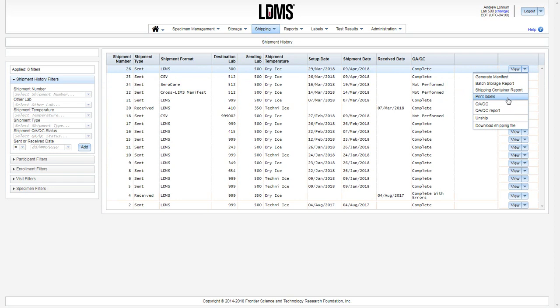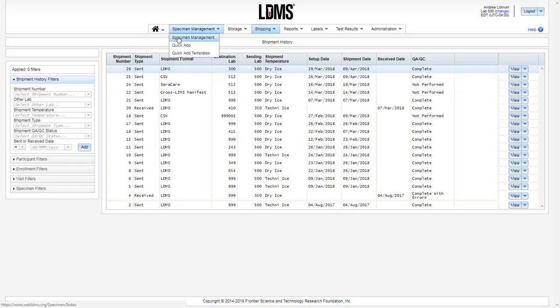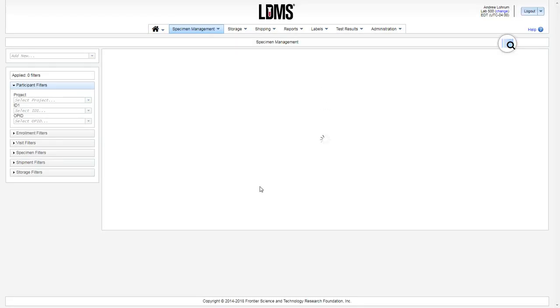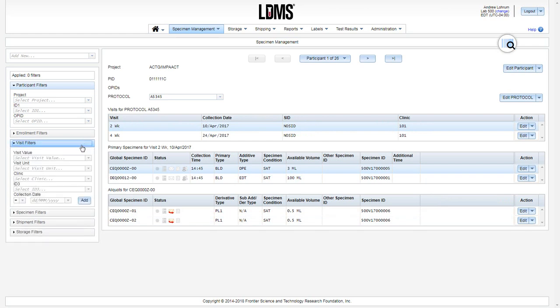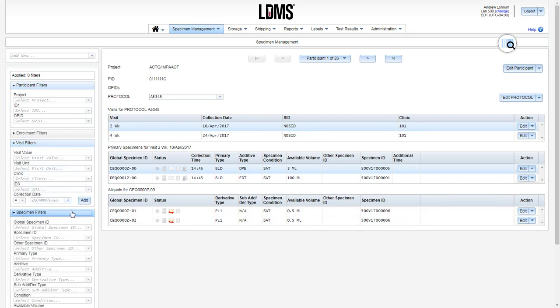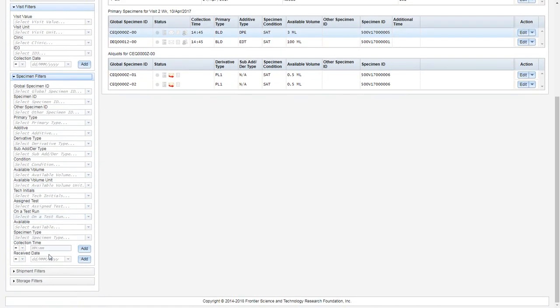After accessioning in QuickAdd, you have two workflows available to print labels for your new specimens. In specimen management, apply a date filter, either within the visit filters and selecting the collection date, or under specimen filters and choosing the received date.